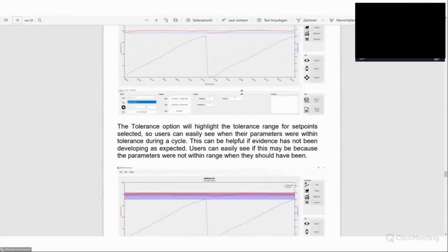There is no need to export it as XY because the original data is already Excel-usable XY data. So if your students want to do any analysis of things, it's a text file, just not called TXT in the end, but it's basically a text file, and you can easily access those. And we would even provide you with the information which column means what. So your students could easily use the raw data and analyze whatever they think should be analyzed.